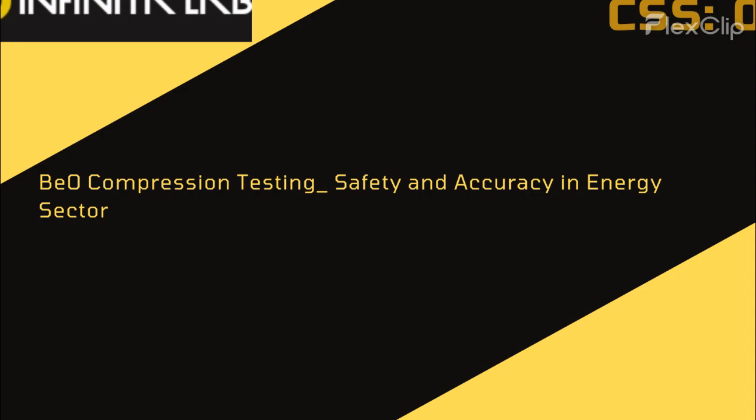And get this, it can actually damage the testing equipment itself. Imagine that the material you're testing could break the machine that's designed to test it. So like needing a super strong safe to hold something that could melt the safe itself. Exactly, it's a real challenge. So this energy company needs to know how much pressure BeO can handle, vital information for its applications.